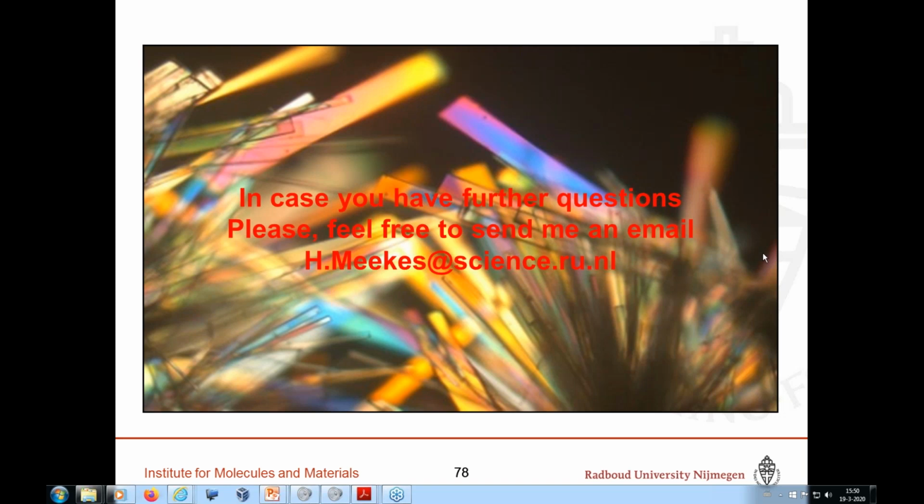Wow, that's a good question, because we normally would always use X-ray diffraction. Let's start with the case that you have a little bit of the pure enantiomer also, then you could do a powder X-ray diffraction experiment. In the diagrams, you will expect the same patterns for a racemic conglomerate as for the pure enantiomer. Now, if you do not have that, then life becomes hard, I would expect.